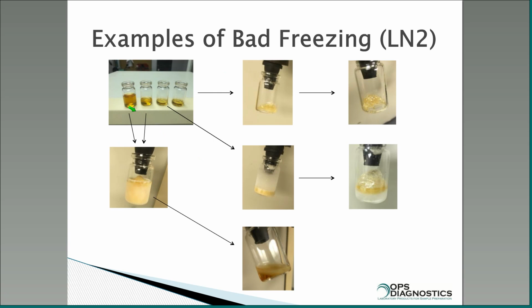So this has like 5 mls, this has 2 mls, this has 1 ml, 1 ml. These two I just froze straight off. They kind of look like that, all right? And then I took one and I just hooked it up without freezing it at all. And then I took one and I froze it just flat and I hooked that up. So I hook it up and I turn it on. So vacuum's on all of these things.